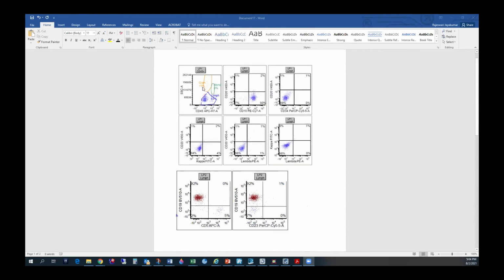And I was thinking it was hematogones, but it doesn't show the spectrum for it. Are they blasts? Yeah, that's what they are. So this patient actually had lymphoblastic transformation of a follicular lymphoma.